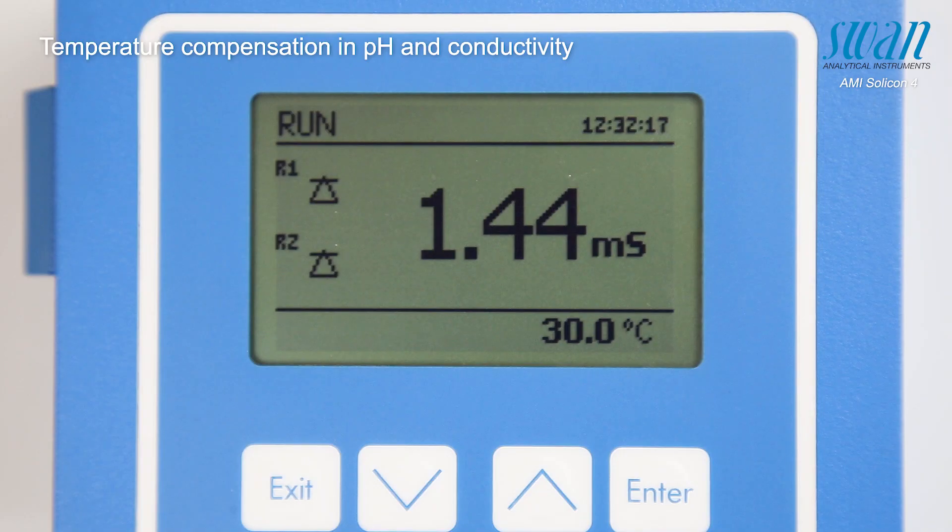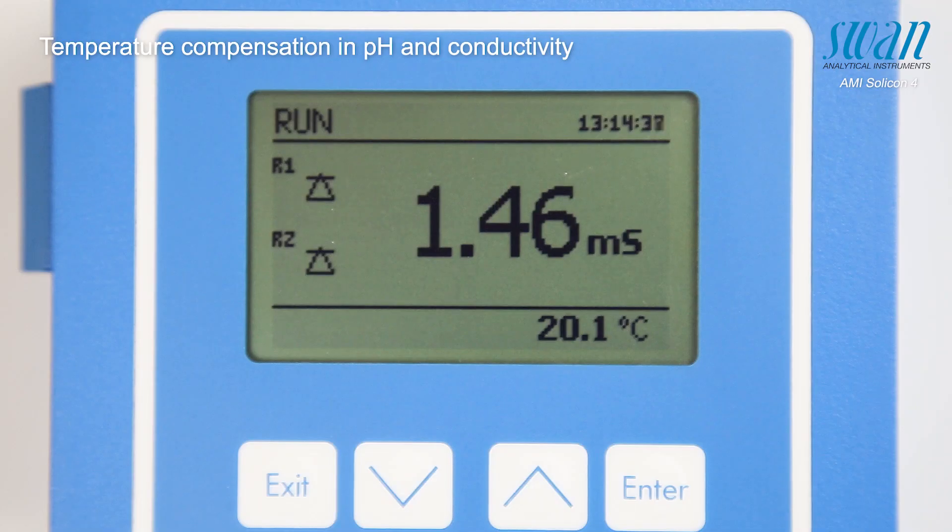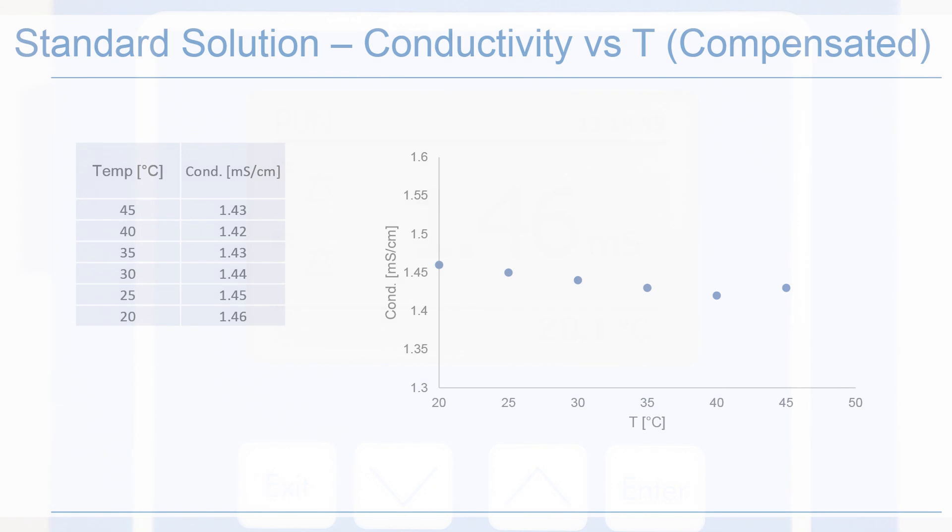As the temperature continues to drop, the measured conductivity value remains stable. This shows that any eventual temperature changes can be compensated within our instrument's accuracy and precision range. These results can be visualized as shown in this final chart.